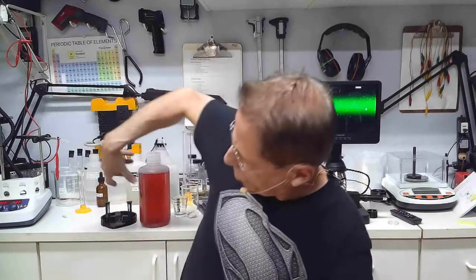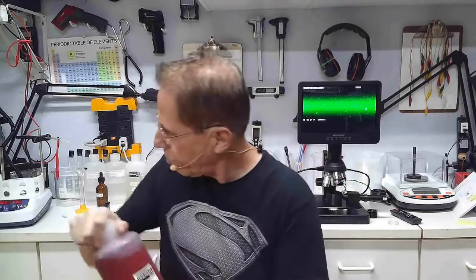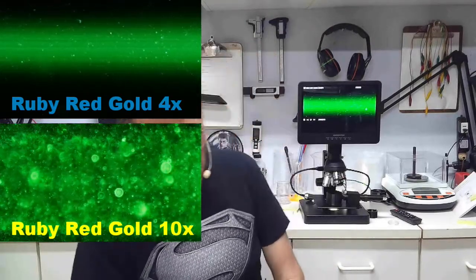This right here is colloidal gold — I was cooking colloidal gold yesterday. This is ruby red colloidal gold. I shot some pictures of the latest batch and I'll show microscope pictures at 4x and 10x. The 4x is definitely impressive, and at 10x you can start to see the actual size of the colloidal gold particles, which you can't really see at 4x.